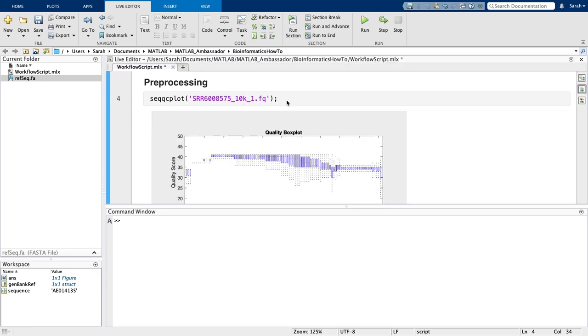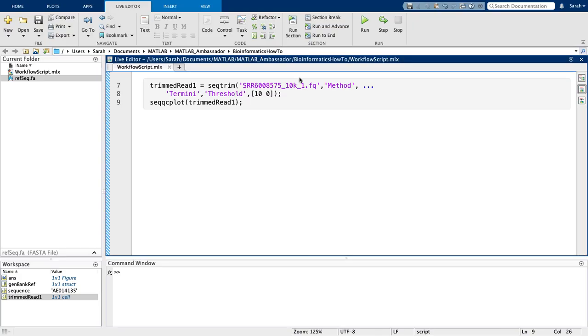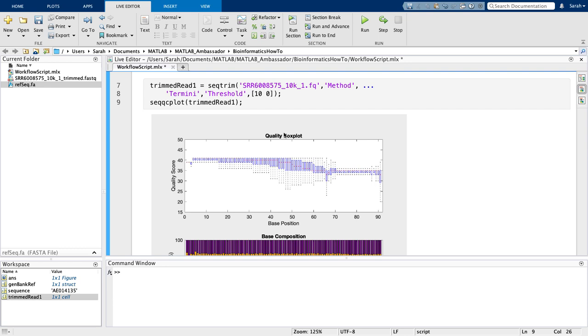You can see the first 10 base pairs on the 5' end of both samples are generally lower in quality score. To clip these pairs off the 5' end, I can use the function SeqTrim.